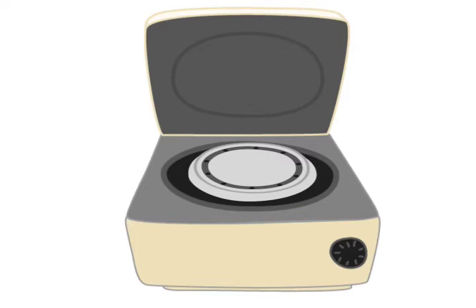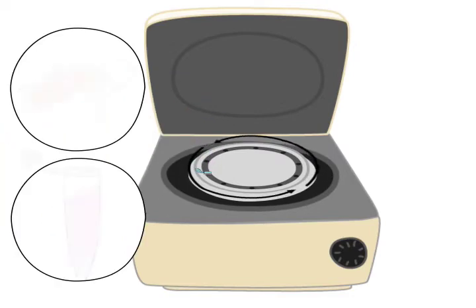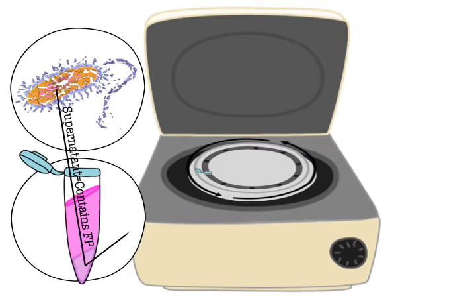Centrifugation is a process in which substances of different densities are separated due to a centrifugal force. In the lab, centrifugation will be used to separate the proteins from the lysed bacteria. The bacteria cells are already in pieces, and when centrifugation occurs, the heavy parts of a cell spin into the pellet and the fluorescent proteins stay in the supernatant.